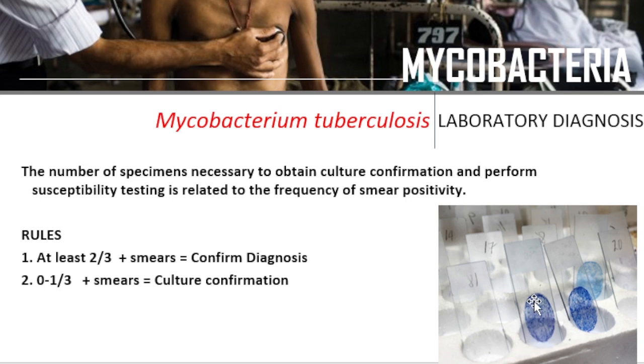You perform a smear for the sputum, which has a standard size. The standard size of the smear for the acid-fast stain is 2 cm in width and 3 cm in length, oval or oblong in shape. Again, 2 cm width and 3 cm length.